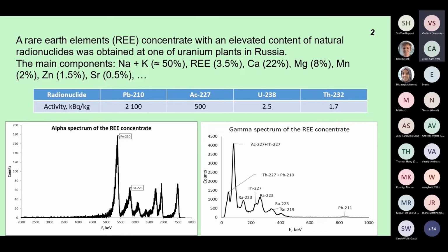Actually, this is a uranium plant with in situ leaching. They made some rare earth concentrate, and then they gave me some concentrate to evaluate the activity. It was a very radioactive concentrate, and you can see that activity was quite high, at least lead-210. The activity was 2 megabecquerels per kilogram.